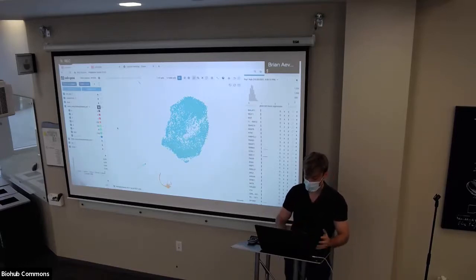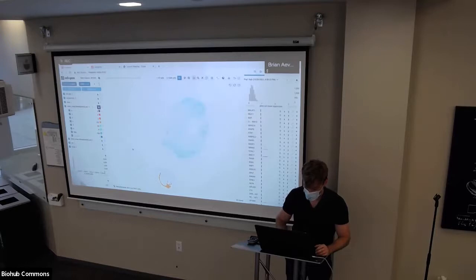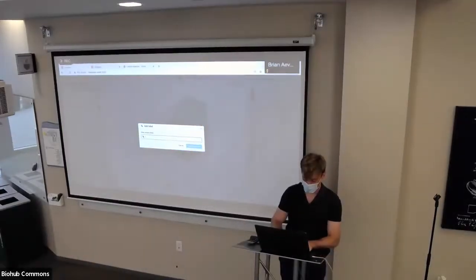And so now I can use this clustering to start annotating my data. Maybe this guy should actually be reclustered, but you get the idea. Let's say I want to relabel blob to something else. Actually, let's say MALAT1. Edit this label's name. And then we can just say cool cell type, whatever.